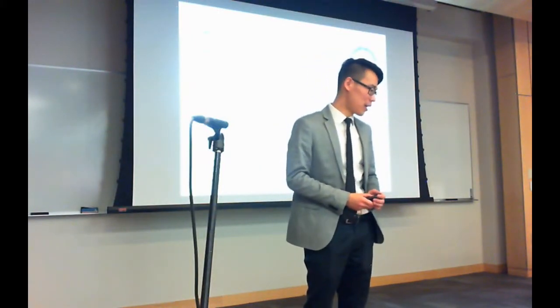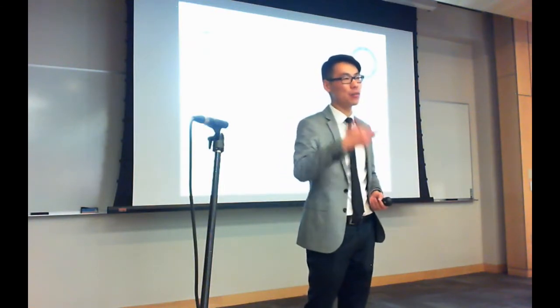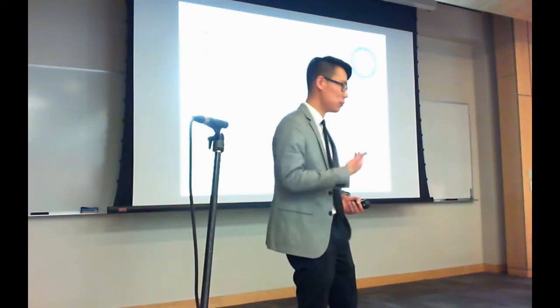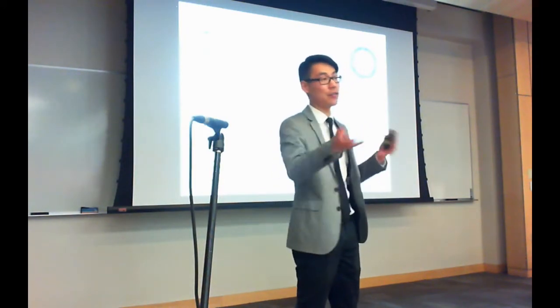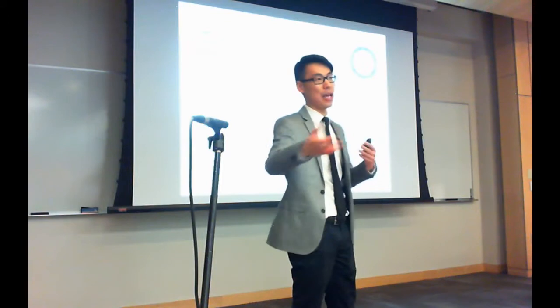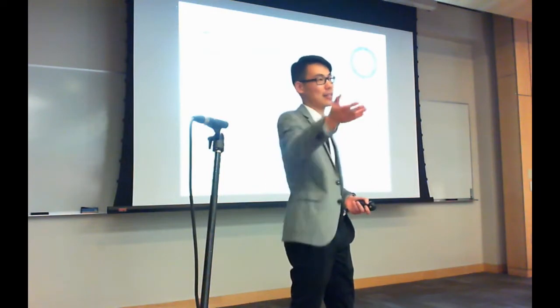I think it'll be pretty easy for us to find and identify all the networks, but there's about 50% of the data that is not in networks. It's going to take a substantial effort because they have no correlated fragmentation, and there's a lot of diversity there for us to actually identify that data. The first couple of steps will be relatively simple, annotating maybe 40, 50% of the data, but taking that last step is going to be quite difficult.